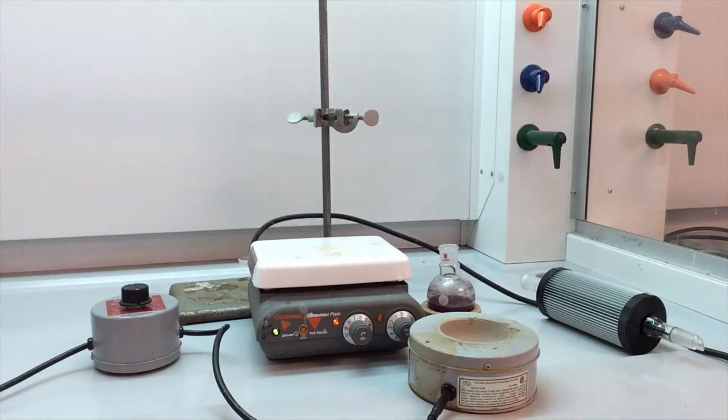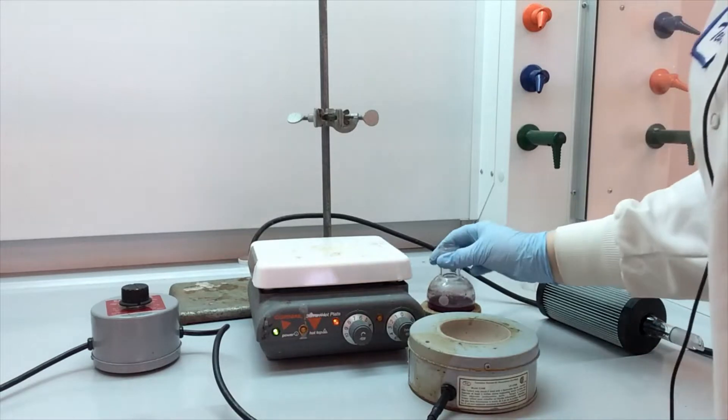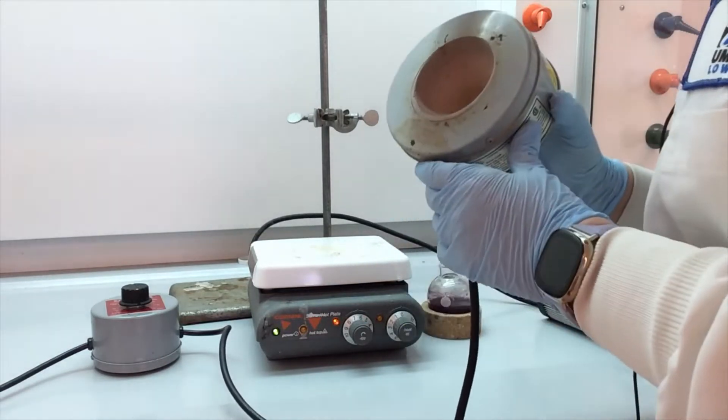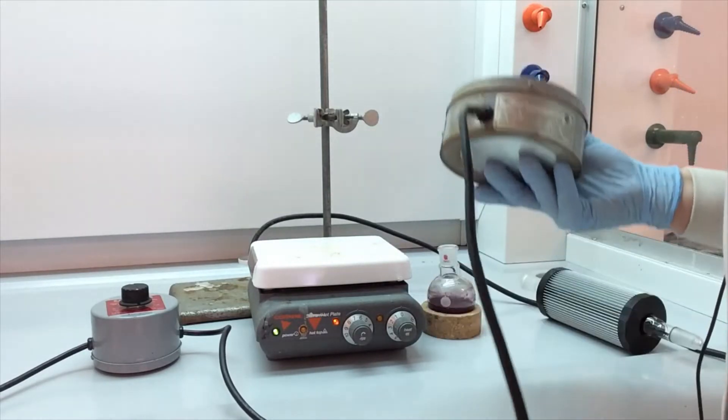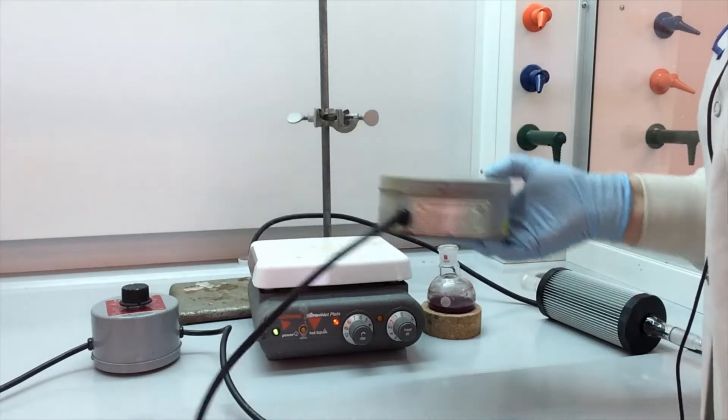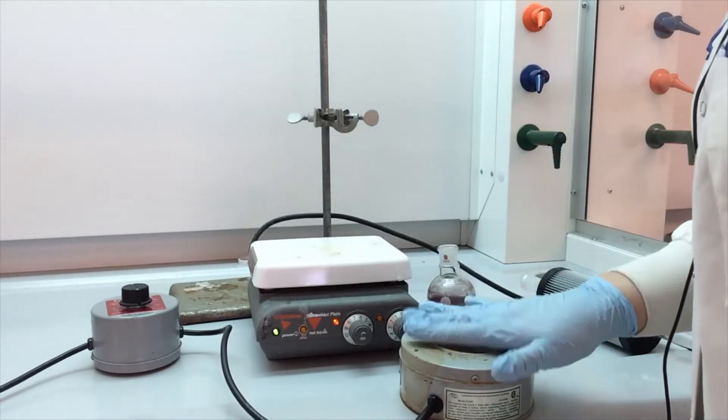So the round bottom flask first. In order to heat a round bottom flask effectively, we need our heating mantle. This consists of two pieces. The first piece is just the mantle that gets hot.